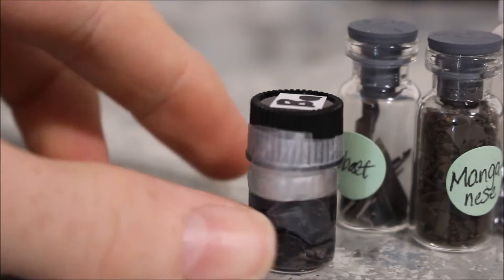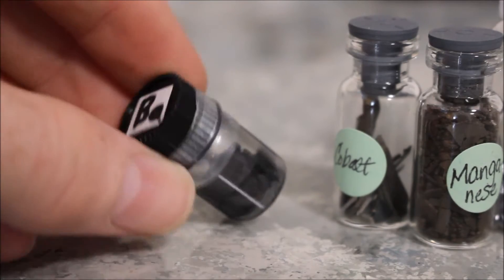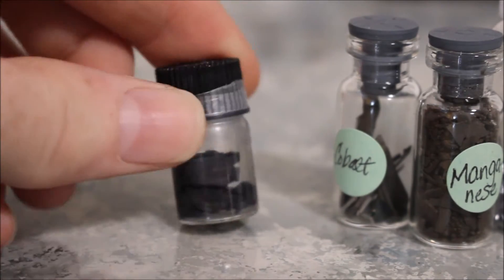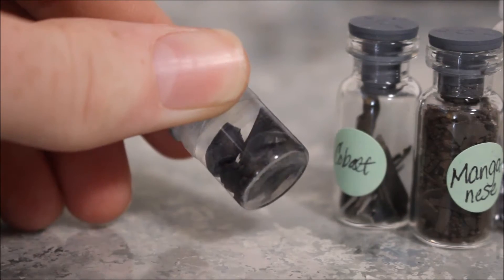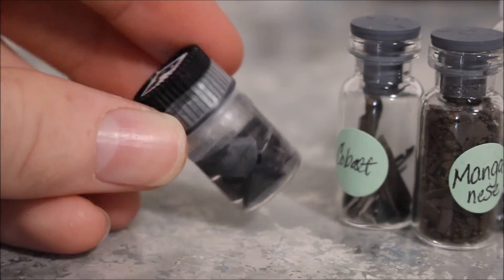Next up is my barium sample. I don't really want to use my barium right now in this video, but if you guys come up with an interesting reaction, I might make a little series and use up a few of these chunks. I don't really know how I'd make it in action.